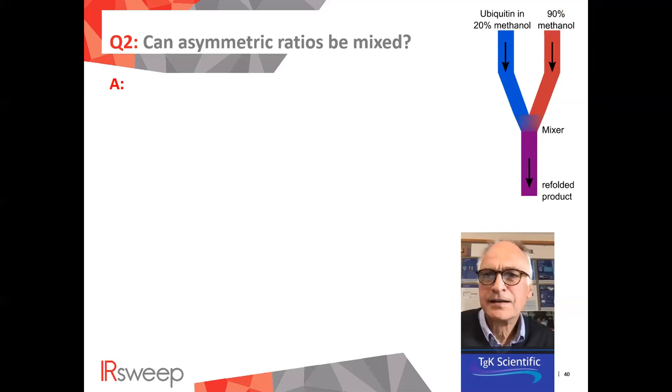Okay. Another one which came in: for heterogeneous catalysis, would the detector have to be in reflectance mode? I am thinking in terms of single crystal or thin layer catalysts to couple to electrochemical sensing.